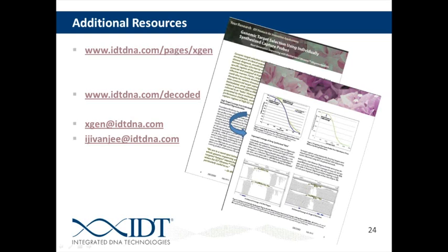Okay, great. Here's another question. I guess I'll give this to Ibrahim first, although Adam might have something to contribute to this. For exon capture, is there a database that we recommend for looking at exome sequences and designing?